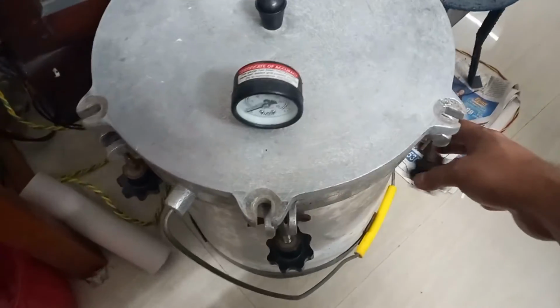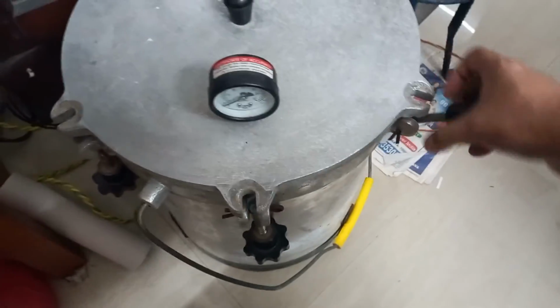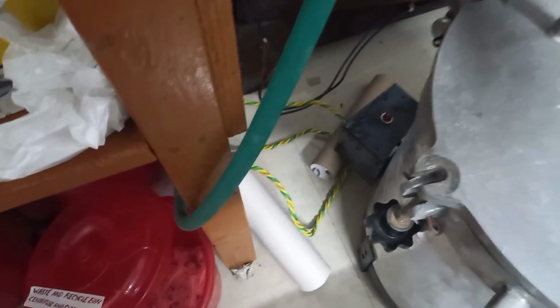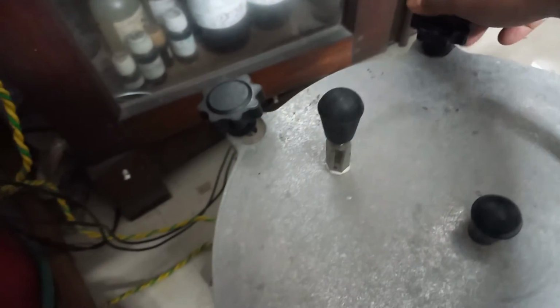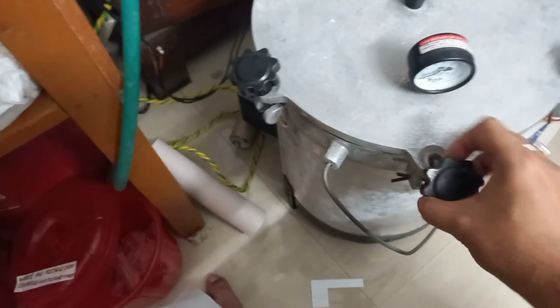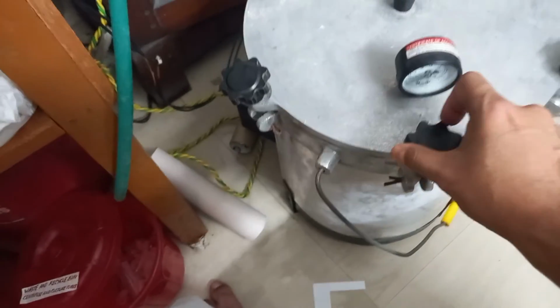And you can see these are the knobs or the screws which we have to lock the autoclave. You have to place the lid of the autoclave properly, and then put the knobs on one by one like that. And this is the way of putting the knobs. So here is the last one. Now we have to tighten the knobs.